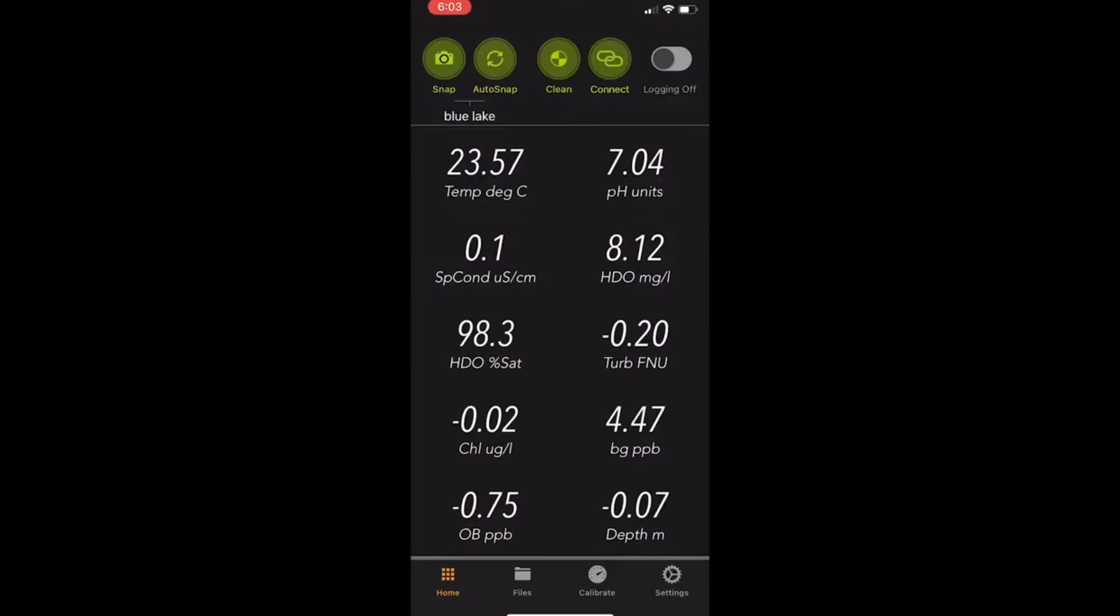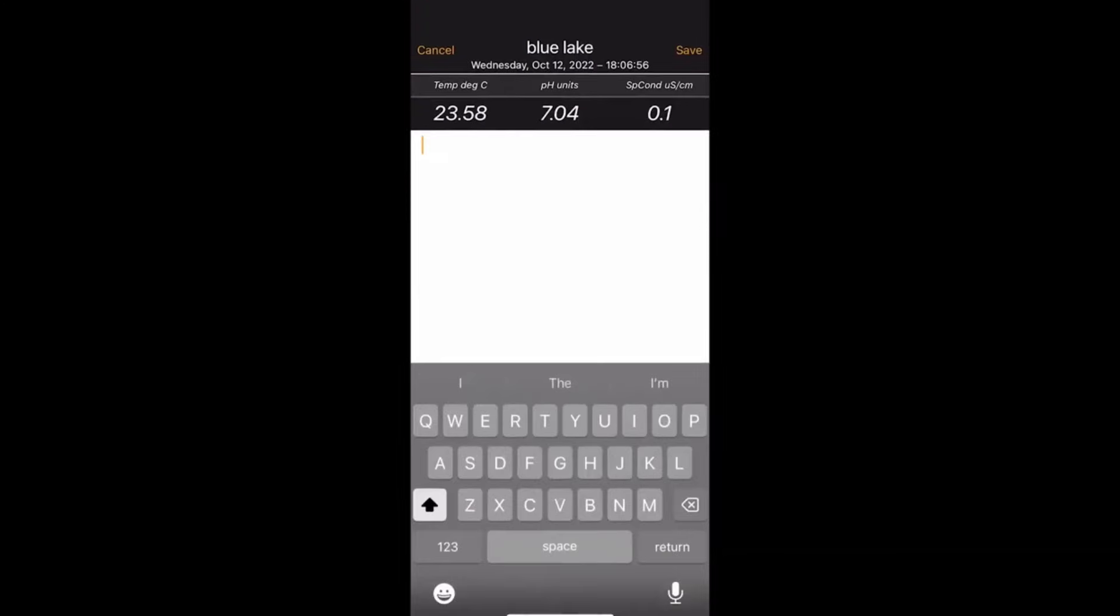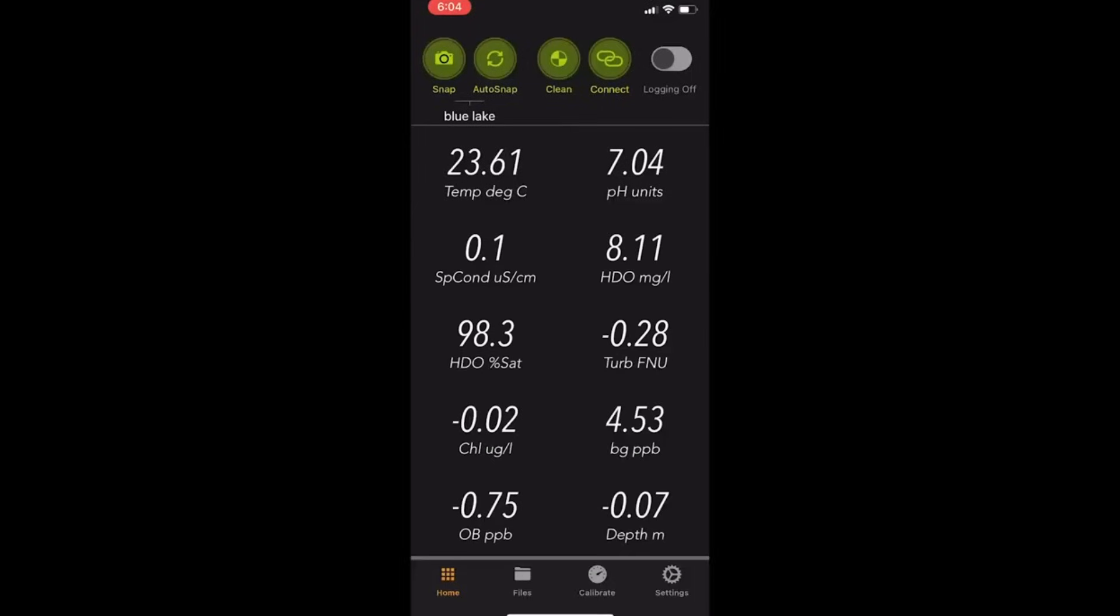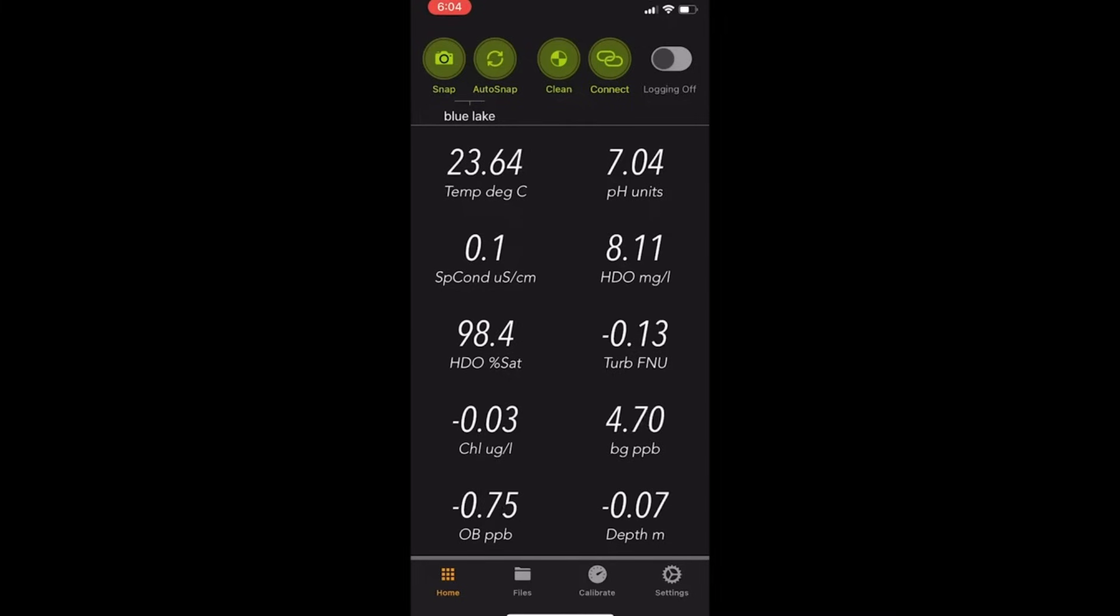We'll start at the top left. Snapshot is a way to record one line of data manually. This will take a reading from all the sensors, put it in one line of data. It'll also give you the option to annotate if there's an annotation needed, and then you can save that snapshot to the snapshot file. You can do this as many times as you want. It'll continue to store logged data into the snapshot file.